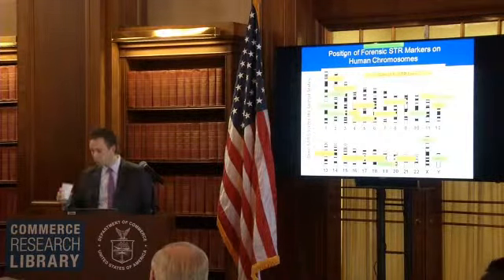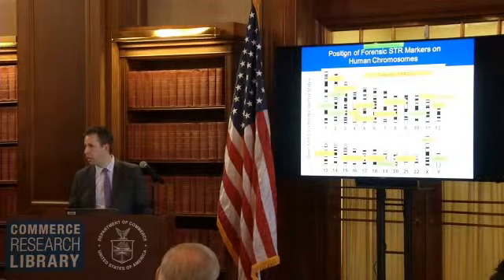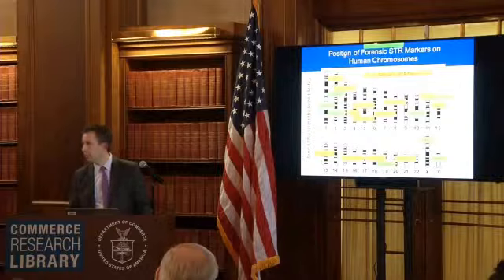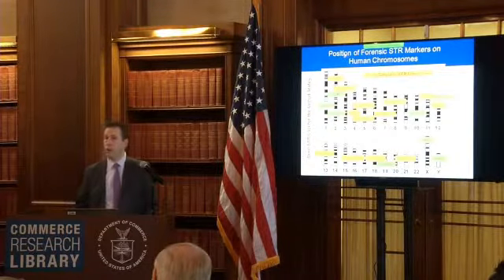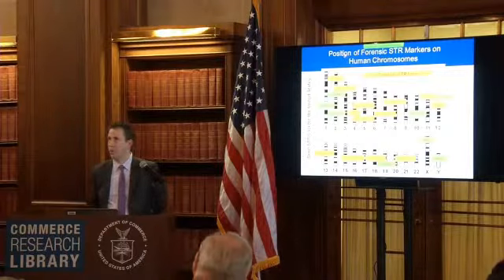And a sort of related question. In the example where you showed the uniqueness looking at the 13 markers, does everyone look at 13 markers? And if so, why are 13 markers selected? Well, everyone is looking at 13 markers right now. They're going to be going to 20, like I said.